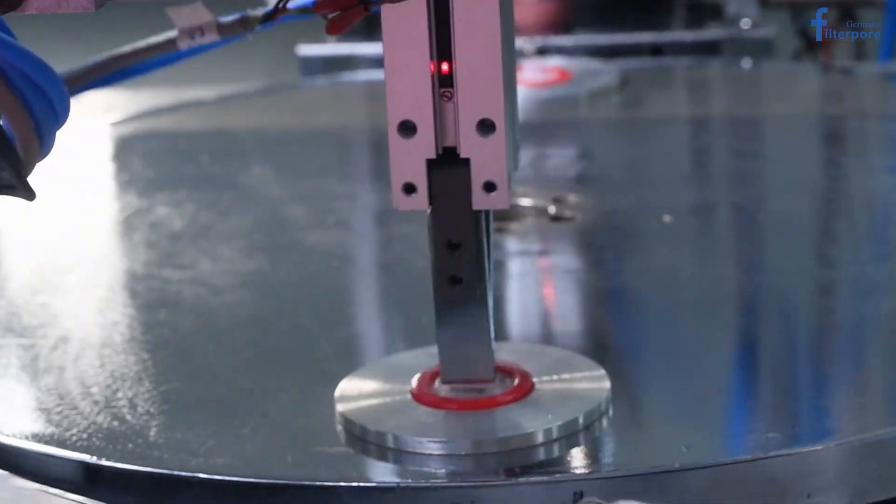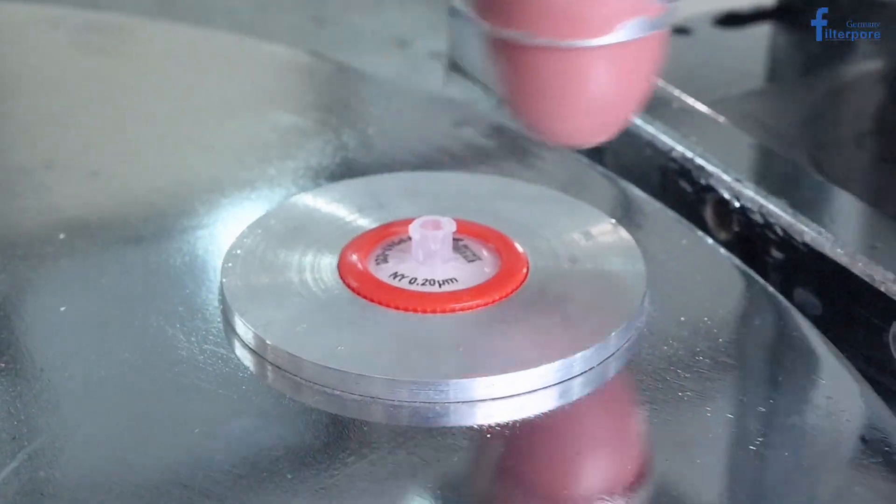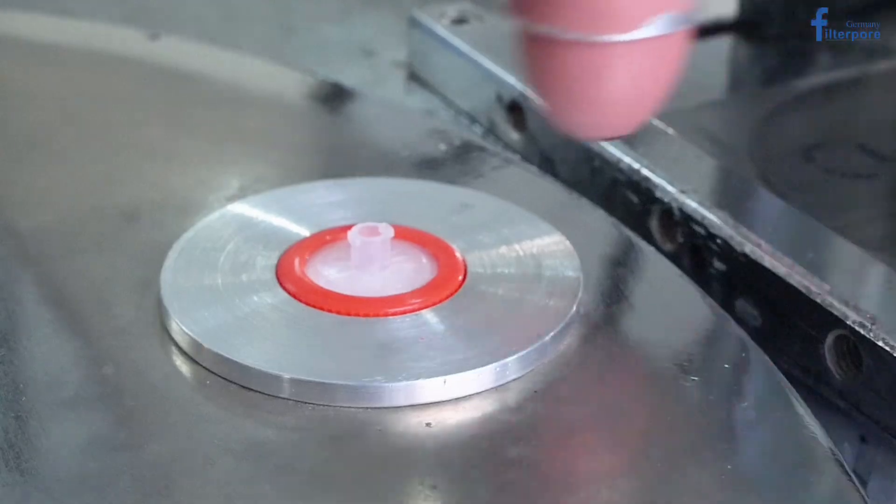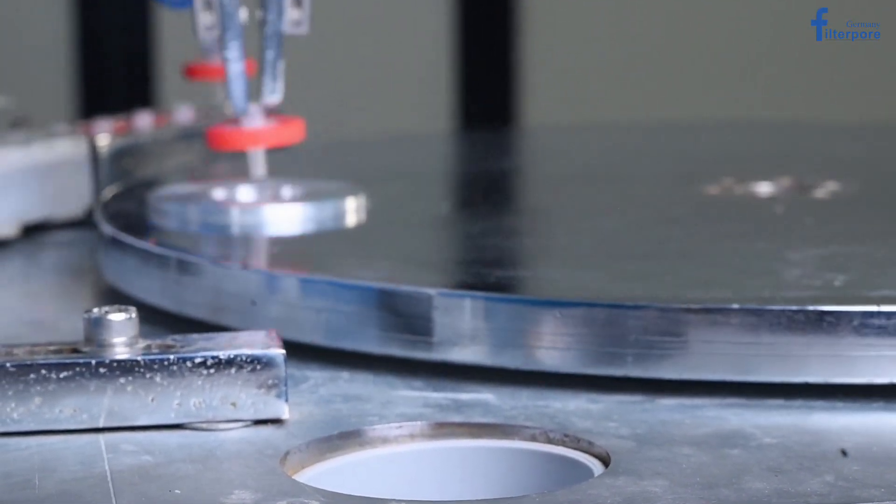FilterPour offers membranes from materials like PTFE, nylon, PVDF, PES, glass fiber, and others, each tailored for specific liquid purification tasks.